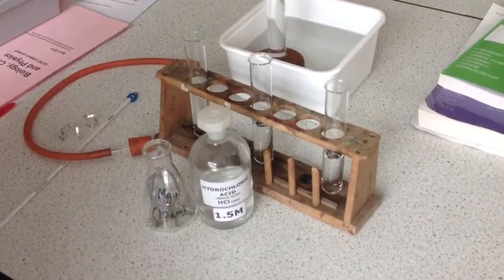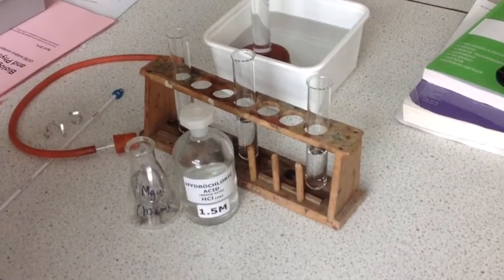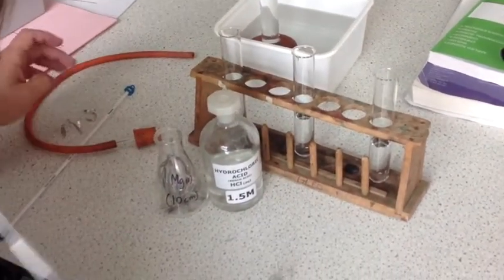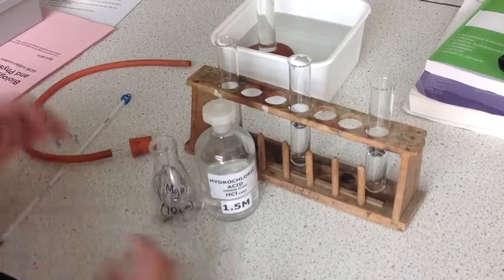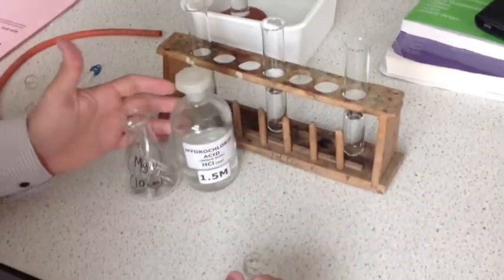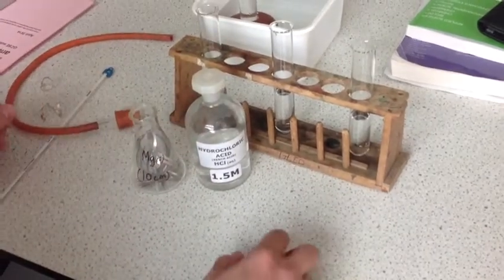Right, so this unit, the first part of it is all about rates of reaction. Whenever you're measuring rates of reaction, it's all about seeing either how quickly something is formed or how quickly something disappears or reacts in a reaction. So the first reaction we're going to look at is that between hydrochloric acid and magnesium.